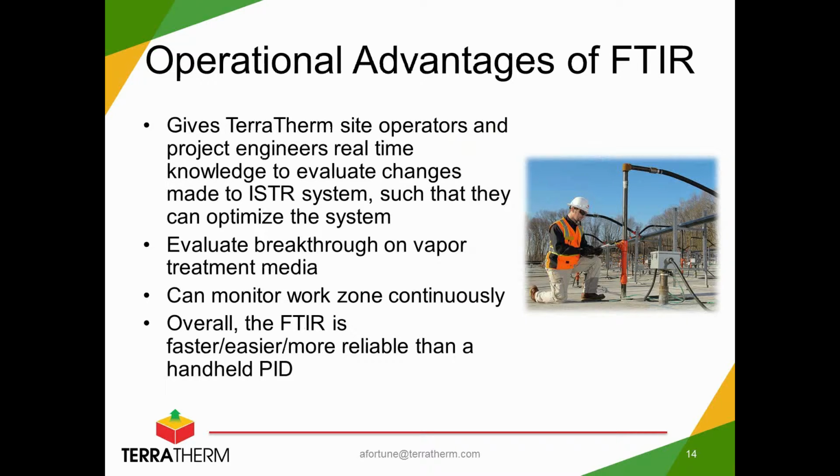So moving on to some of the operational advantages that we saw while using this instrument at the site. One of the biggest pieces of feedback that I received from our site operators at this particular site was that they loved it because it really gave them real-time knowledge to evaluate their changes made to the system so that they could optimize it real-time and know what they were doing.